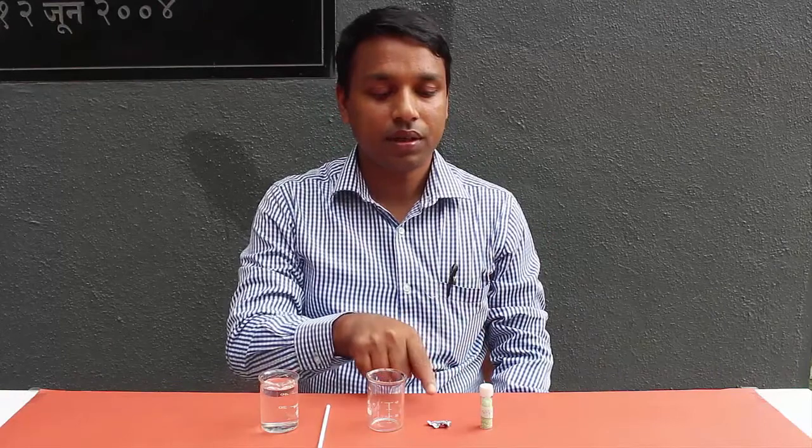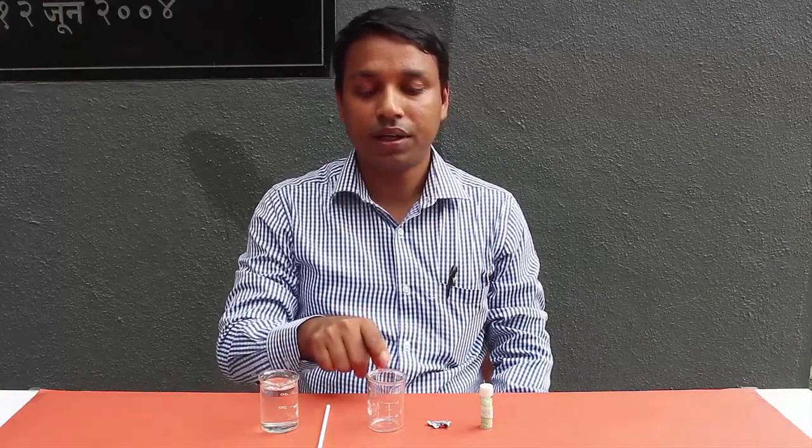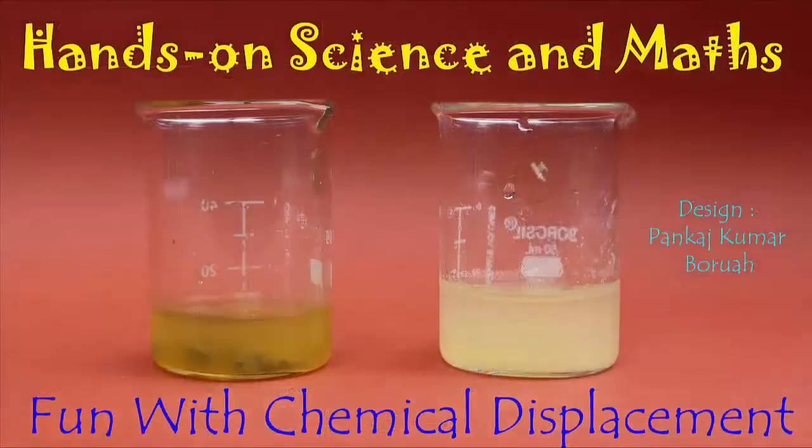In today's chemistry experiment, we will conduct and discuss a displacement reaction. For this, we will need some crystals of ferrous sulfate, pieces of zinc metal, an empty beaker, a stirrer, and a glass full of water.